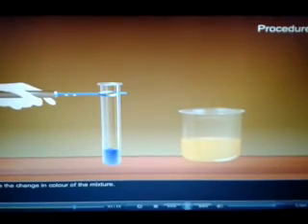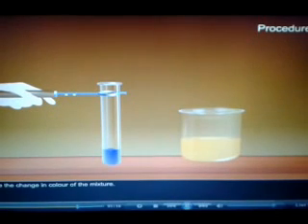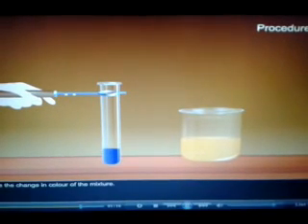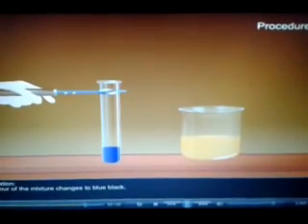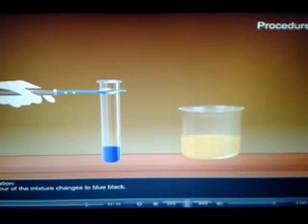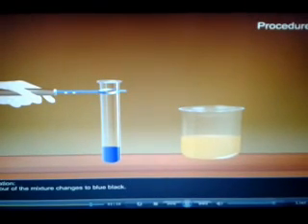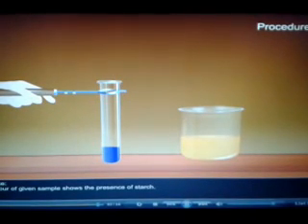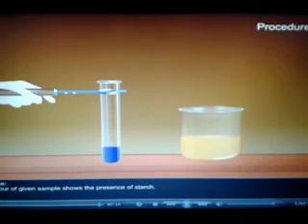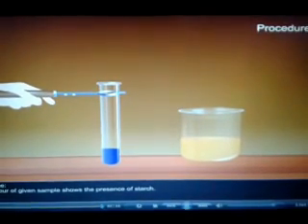Observe the change in color of the mixture. Observation: The color of the mixture changes to blue-black. Inference: The blue-black color of the given sample shows the presence of starch.